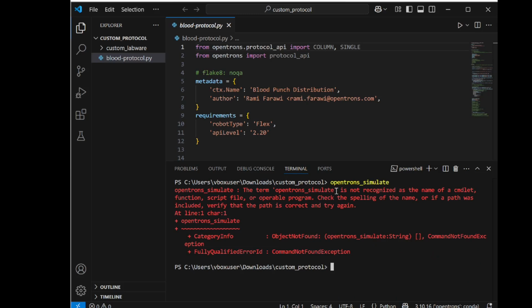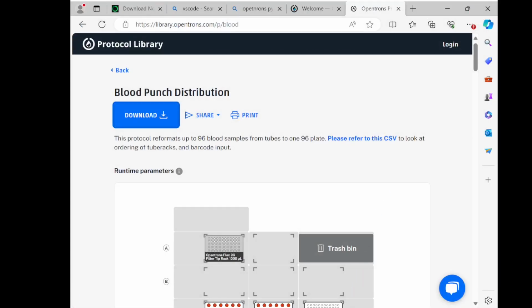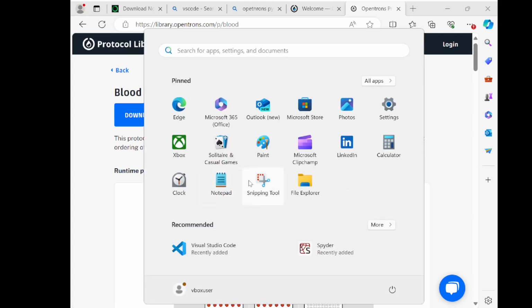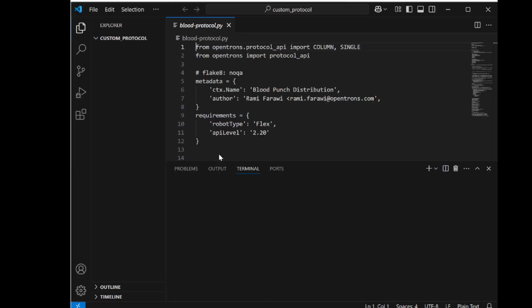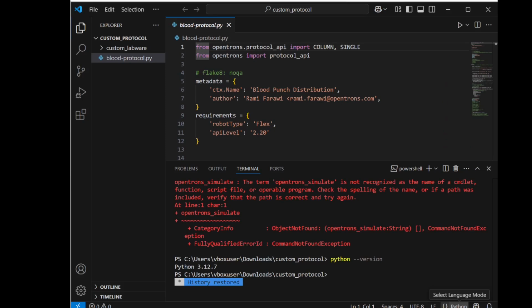Okay, this is again an example. We are not in the right environment, because this is showing that 3.12 is still opening. So I'm just going to close this. Let's go back to VS Code. This is opening, and let's see what Python version it is going to activate.